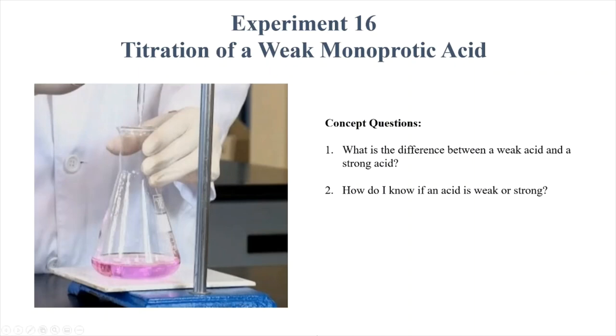The first concept question we're going to address is, what is the difference between a weak and a strong acid? And the other concept question is, how do I know if an acid is weak or strong? Now, these are important because the titration curves for a weak acid versus a strong acid and a strong base are different, and we're going to look at that in a couple of slides. So how do we know if an acid is weak or strong, and what is the difference? So we're going to take a look at that now.